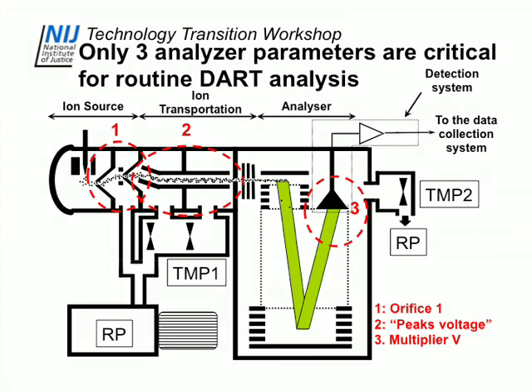The good news is, after all this complex stuff I've been talking about, there are only 3 parameters you need to know about on a routine basis. When you set the instrument up and install it in the lab, you go through a tuning process, which I do so rarely. I just look it up in the manual and follow the instructions. But when you're in the lab, there are only 3 things we want to think about.